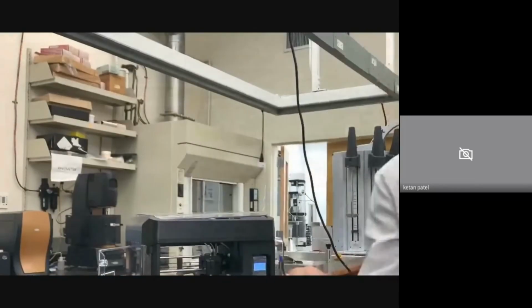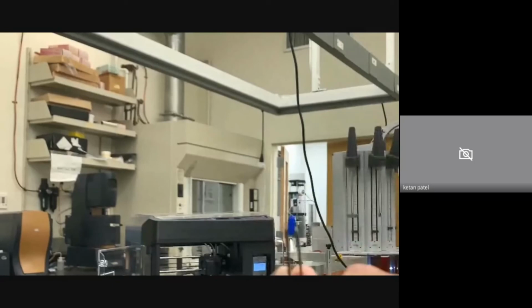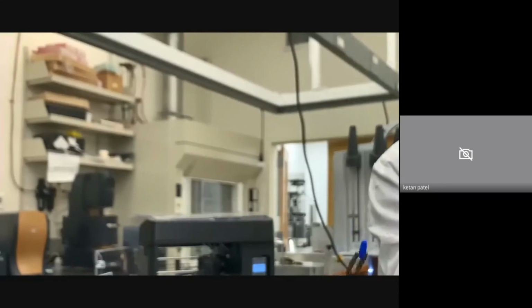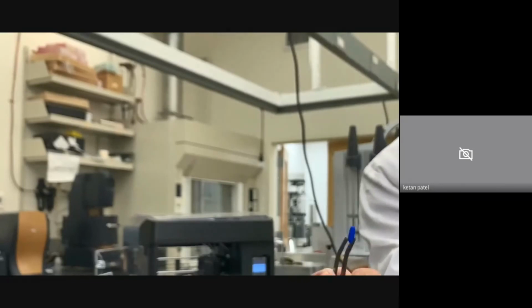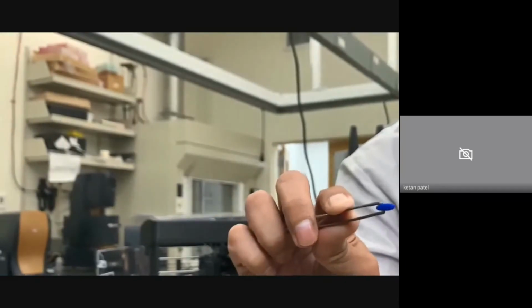As you can see, we just printed one tablet. So this is a pretty tiny tablet you can see with 3D printer based on the weight of this tablet. Usually this size of tablet, based on infill pattern and infill density, weighs around 85 milligram to 100 milligram, which can cover a dose of, let's say, 10 milligram to 20 milligram of drug based on the drug loading.